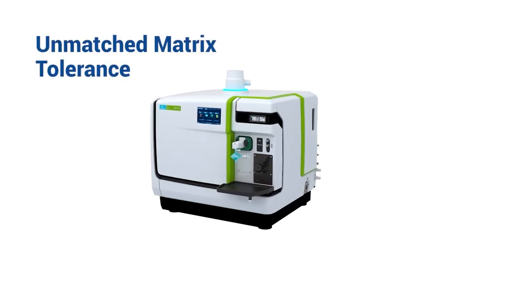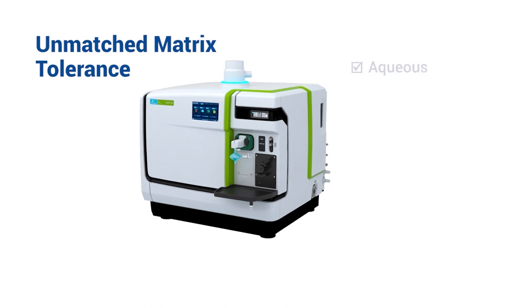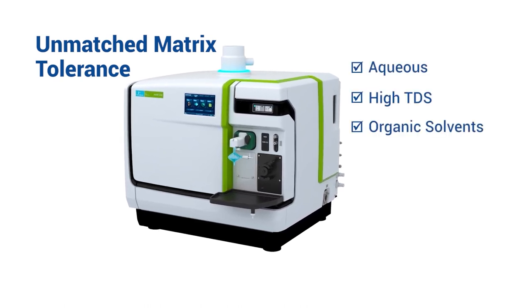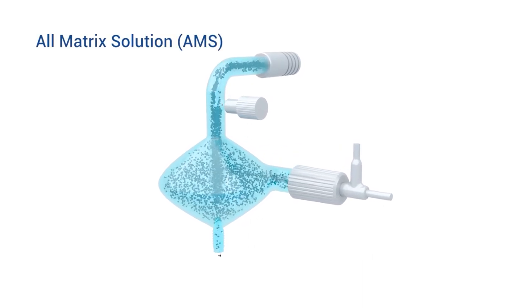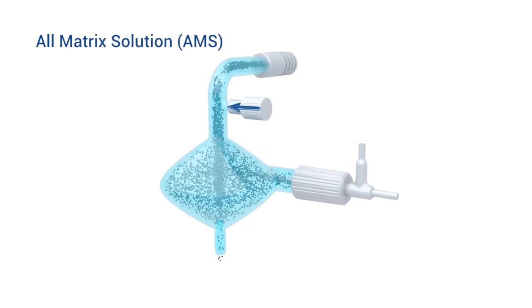The NexION 2200 ICP-MS is designed to accommodate a wide range of sample matrices. Its powerful all-matrix solution sample introduction system allows online gas dilution.